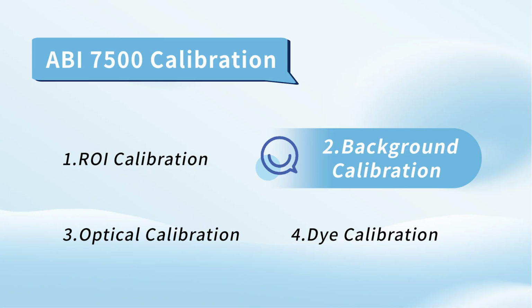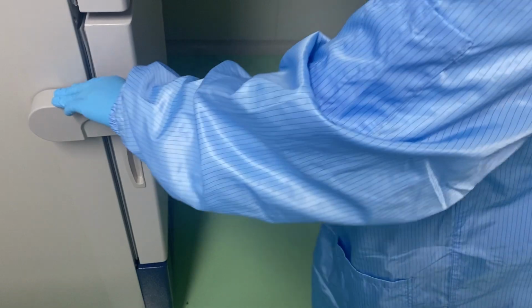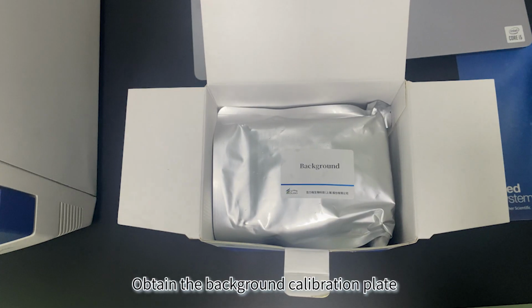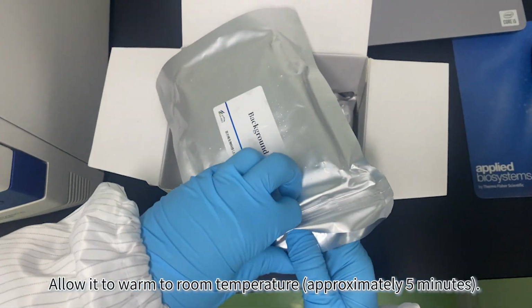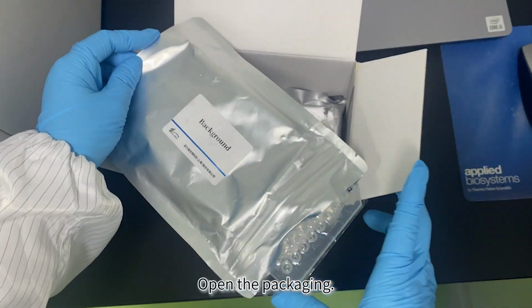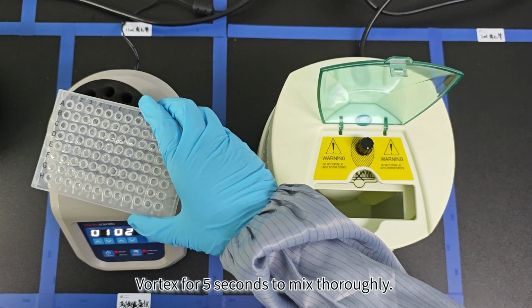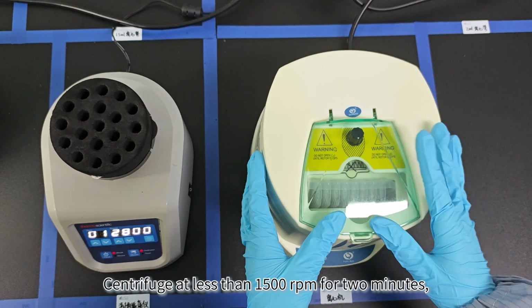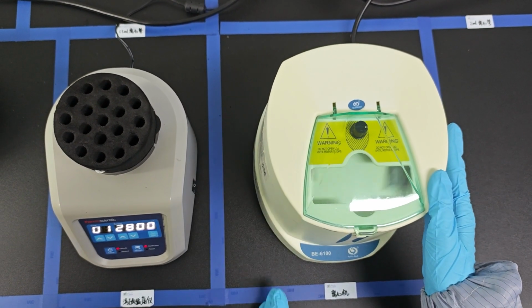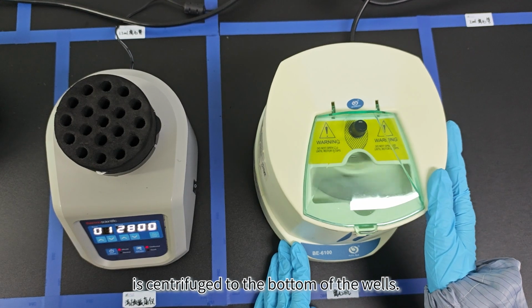Next, perform background calibration. Calibrate the ABI 7500 using the background calibration plate. Obtain the background calibration plate from the Spectral Calibration Kit in the freezer. Allow it to warm to room temperature. Open the packaging. Remove the background calibration plate. Vortex for 5 seconds to mix thoroughly. Centrifuge at less than 1,500 revolutions per minute for 2 minutes, ensuring that the liquid in the calibration plate is centrifuged to the bottom of the wells.